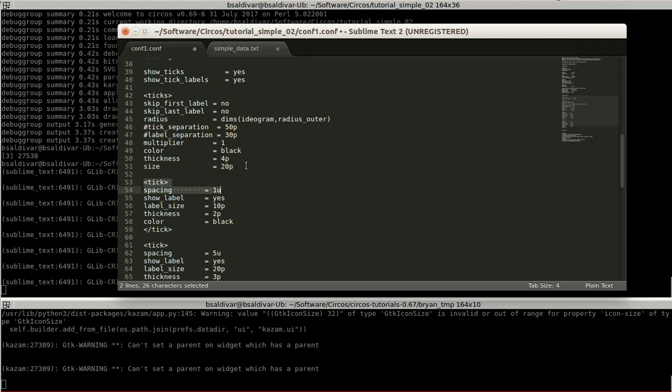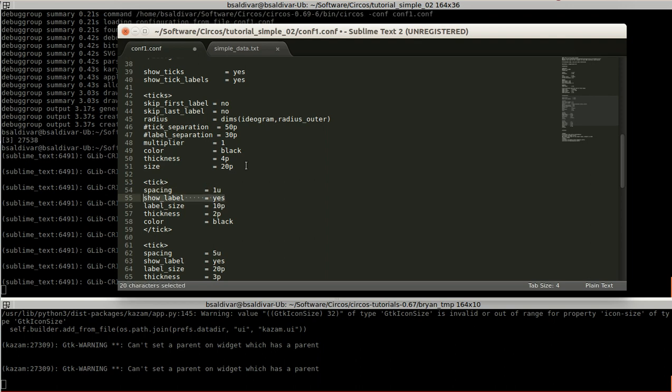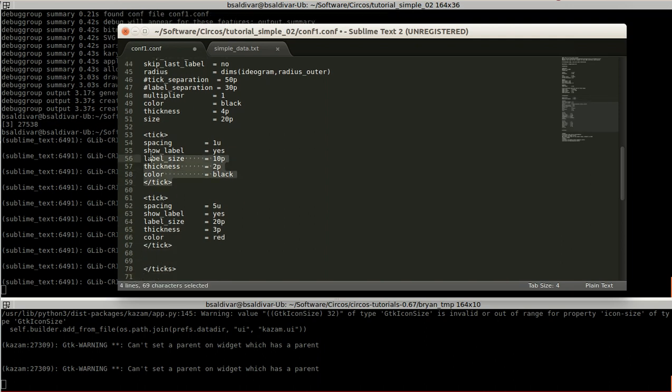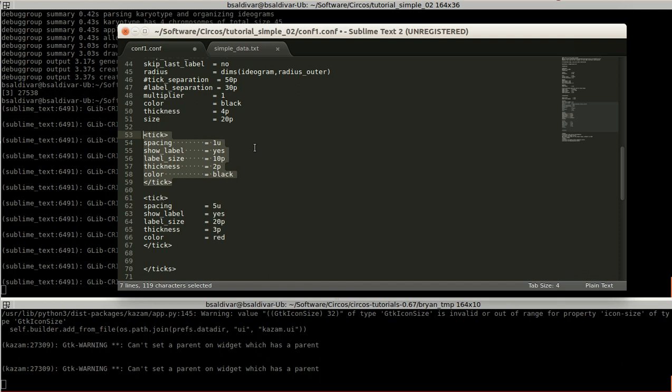This is for, in this case of the spacing, we can define different ticks or each kind of spacing. Here is that one unit, which means that each one unit there is going to be one tick. Then show label means we want to see the numbers of each unit, the size of the label, how thick they're going to be, and the color. So far, this part means that each one unit of our karyotype is going to be seen, or there is going to be a line outwards the karyotype, showing one unit.